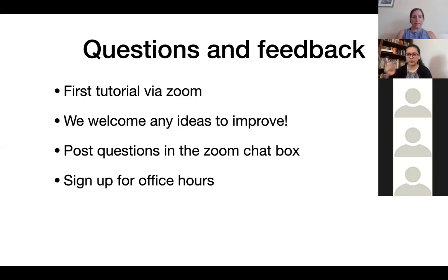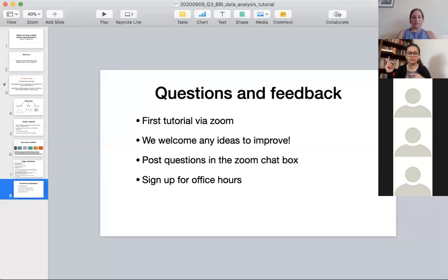Cool. So I'll switch over to my RStudio now, and feel free to just work along with the tutorial with me. If you feel that you're not quite ready and you need help on the beginning parts, you can just watch, and then at the end of the session we'll have a couple of breakout rooms for those that need help with the beginning parts, that have not attended the previous tutorials and are doing this for the first time. And we'll have this room as well to answer all the questions that you have. Hopefully we have time. Okay, so I'm going to stop sharing.